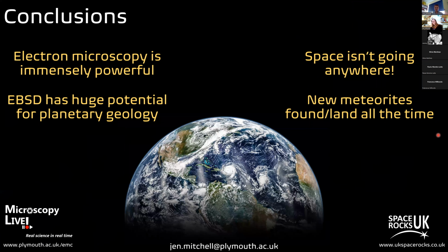So it's quite a short Imaging Matters this time, mostly because I've been busy doing my analysis rather than making presentations. But electron microscopy is immensely powerful, and it has huge potential, and particularly with the uprising of EBSD, there's a lot left that we can do and a lot of things that we can reanalyze using EBSD and fill in some gaps in our knowledge.